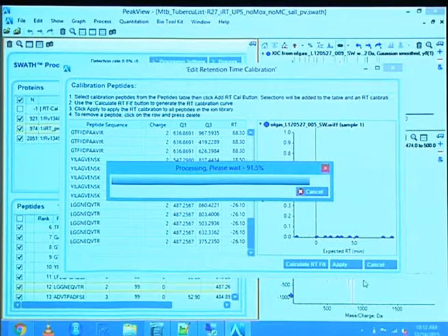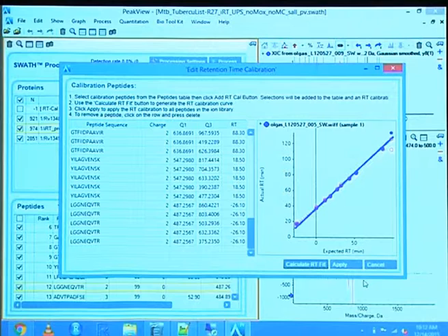re-equilibration step, so there's not that much signal. I don't think it is as interactive, but yes, it's nice once you get to the result display. There you go. And now you see why I chose these 3, because there's an issue.